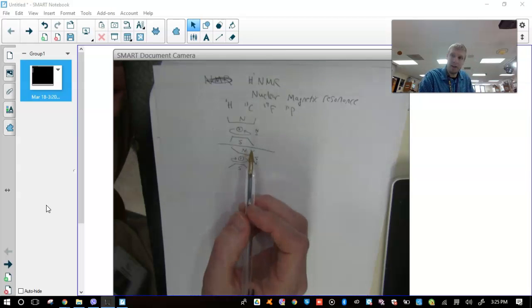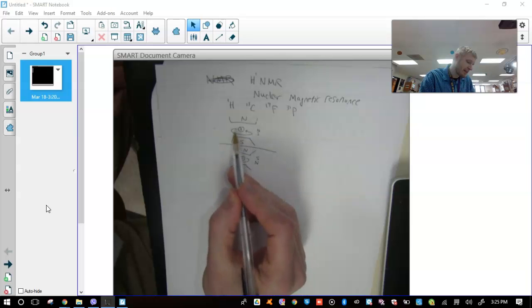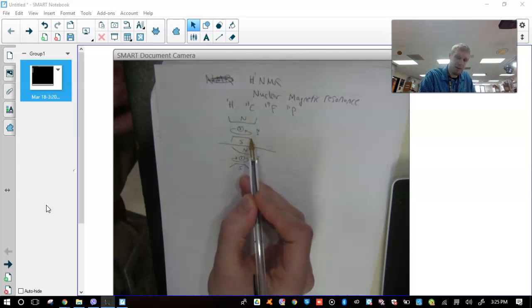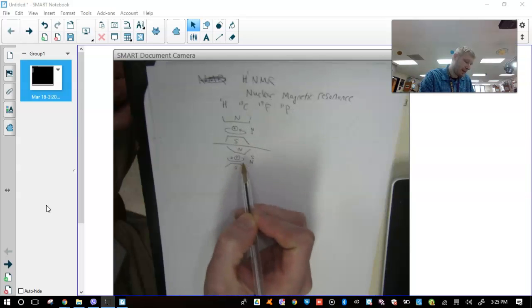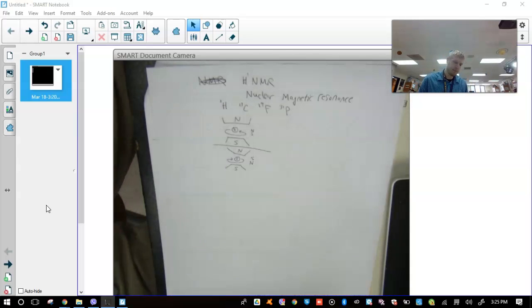They call an MRI an MRI because it doesn't have the word nuclear, so it sounds safer. So right here we've got the spin, and under the right frequency of the radio waves, it will flip within those magnets and start spinning the other direction, and that can be detected in the spectra.